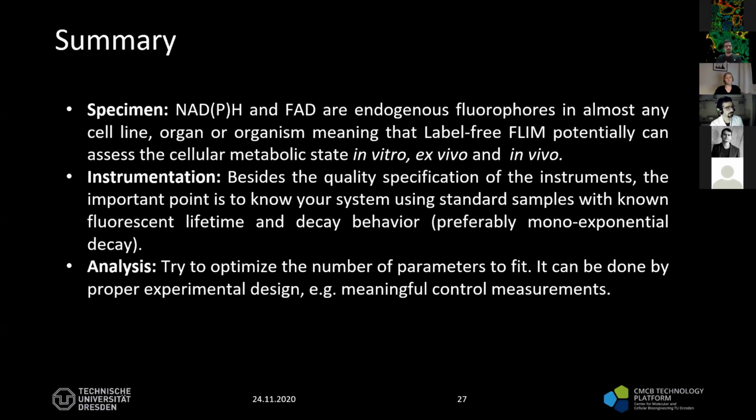And the last one is analysis: try to optimize the number of parameters to fit. So minimize the number of parameters that you want to fit as much as possible, because when you increase the number of components, you also increase the number of amplitudes you are going to fit.